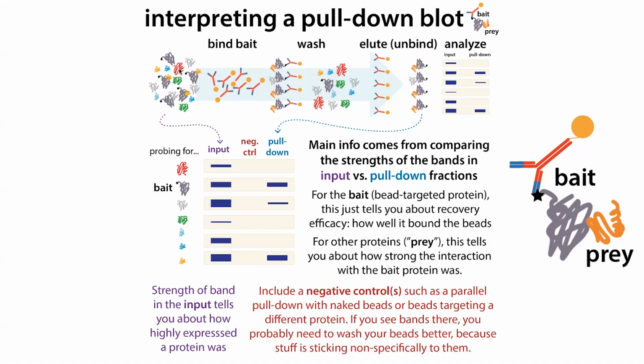Again, this is going to be less physiologically relevant than if you were detecting interactions that were happening naturally inside the cell, and you have to worry about whether you're adding too much of the protein. The more protein you have, the further away from natural conditions you are, and the more likely you are to get interactions that aren't naturally happening. But you can add this purified protein and see if it can bind, not necessarily whether it does normally bind, but whether it can bind.